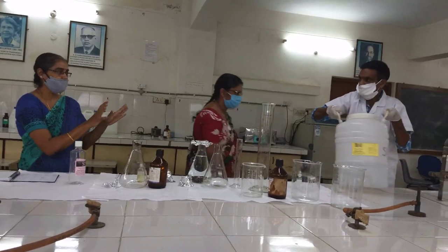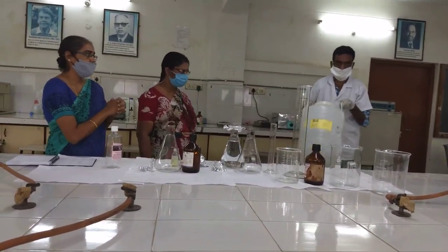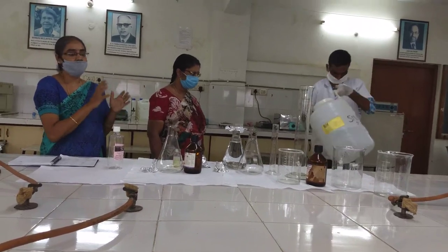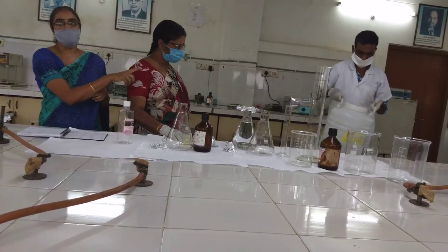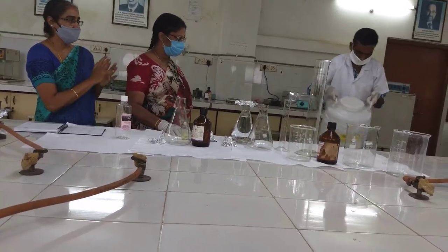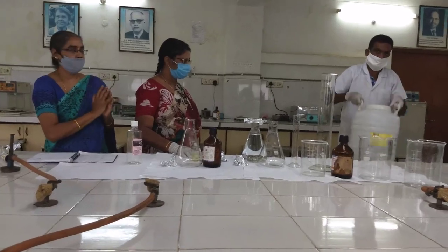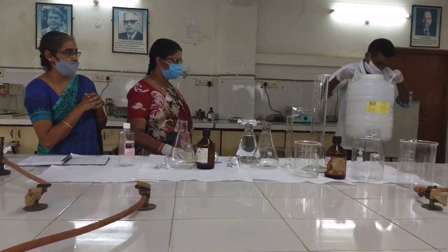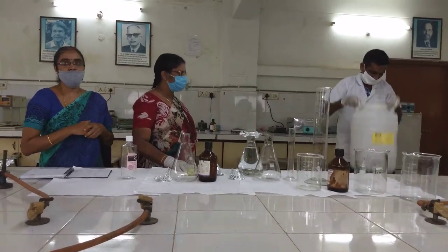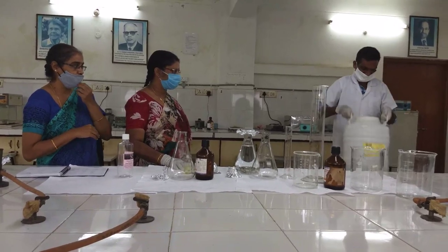We have added up all the components and now we make sure that all the contents we have added are mixed up thoroughly. The lab assistant is mixing the 10-liter container of hand sanitizer which we have prepared fresh.